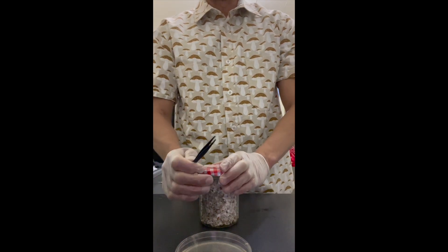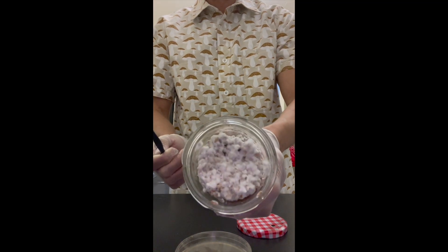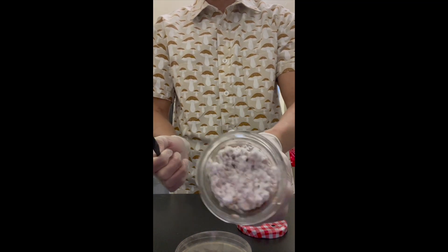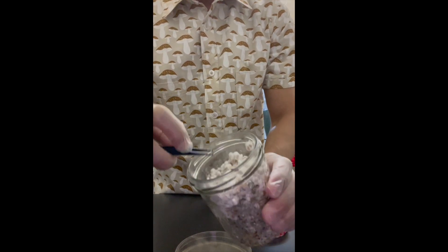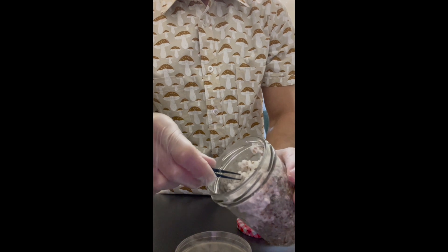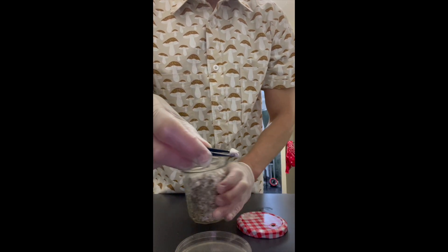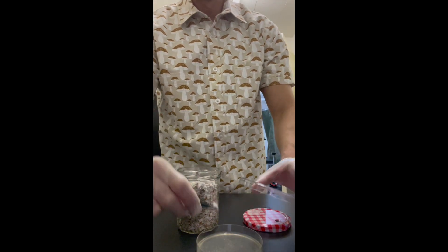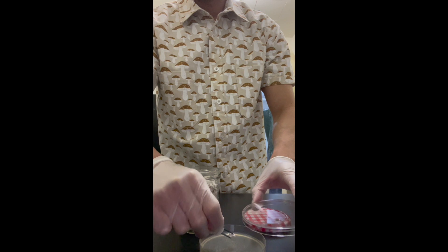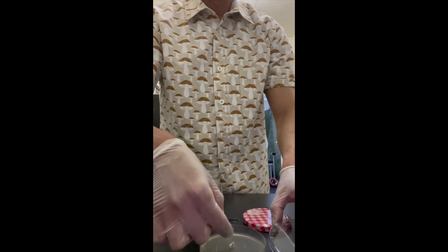Tweezers are sterilized. I'm going to open up the jar. As you can see, the top part is beautiful. I'll take my tweezers — see if I can get a good video for you guys. As you can see, there are a couple of different kinds of growth inside there. I grabbed the tweezer and I'm going to open the plate really quick and just drop the grain into the agar dish.